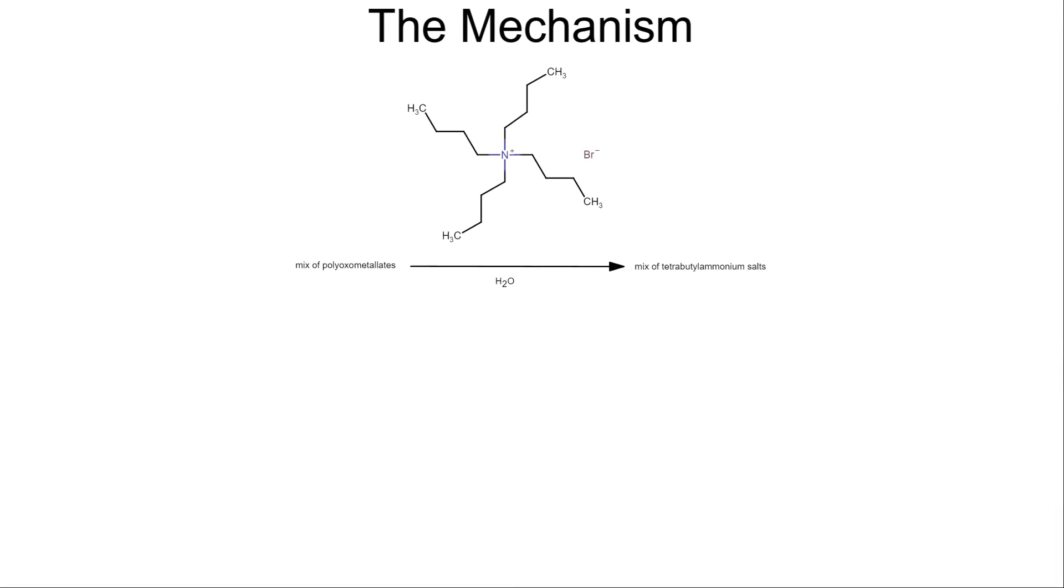When the tetrabutyl ammonium bromide solution is added, it shifts out any other cations, forming a mixture of tetrabutyl ammonium polyoxometalates. The major one formed, however, is a water-insoluble white precipitate of tetrabutyl ammonium octamolybdate.